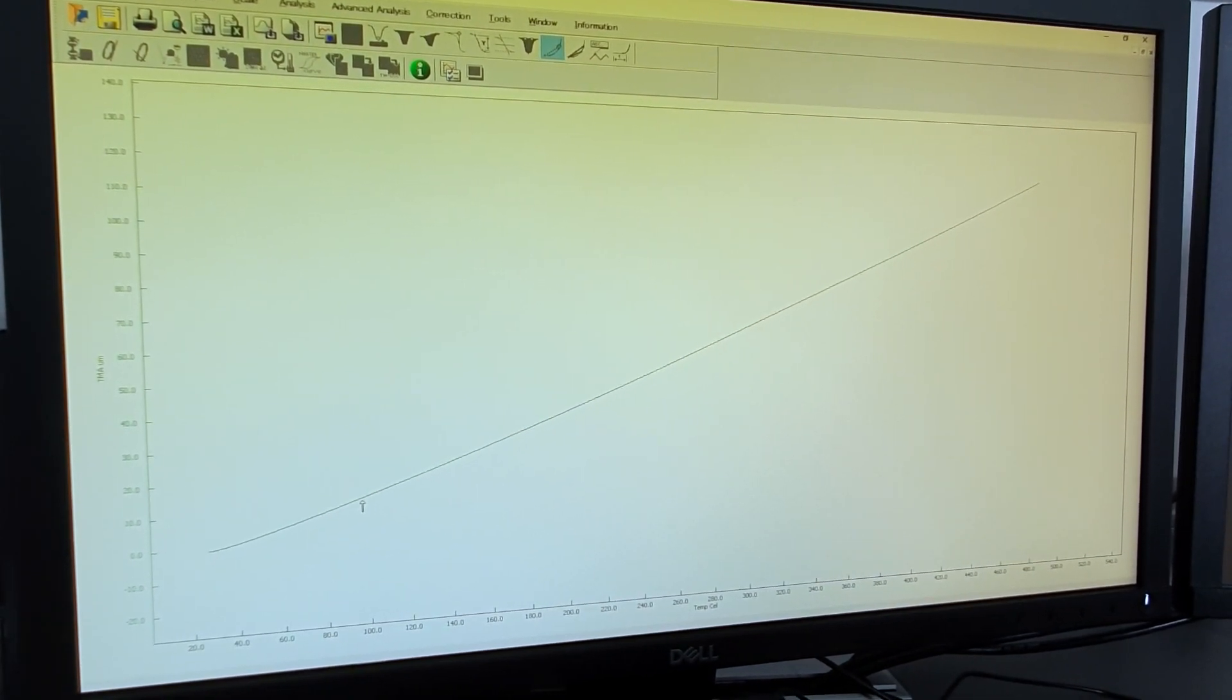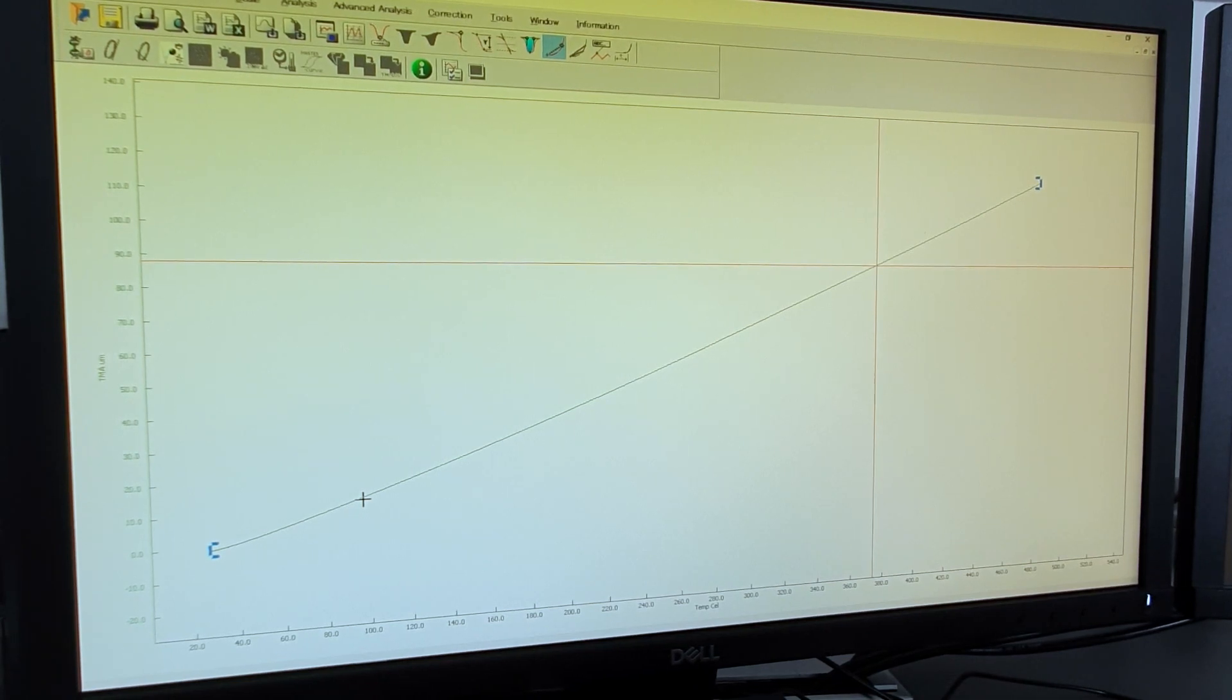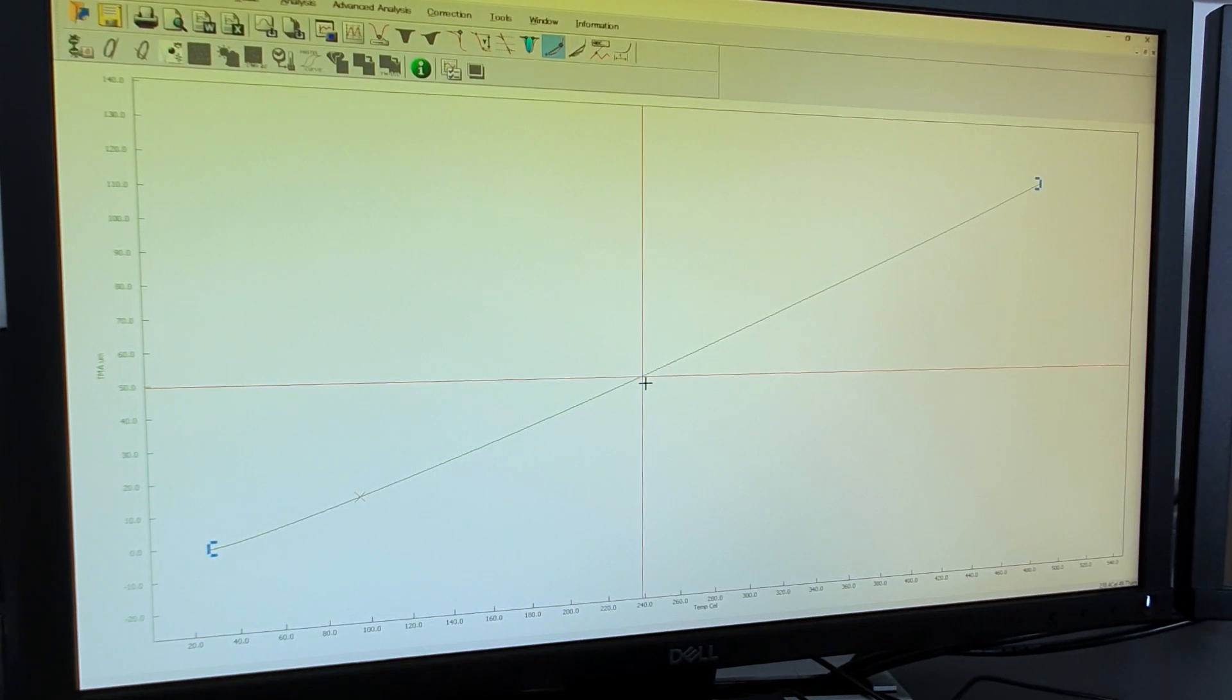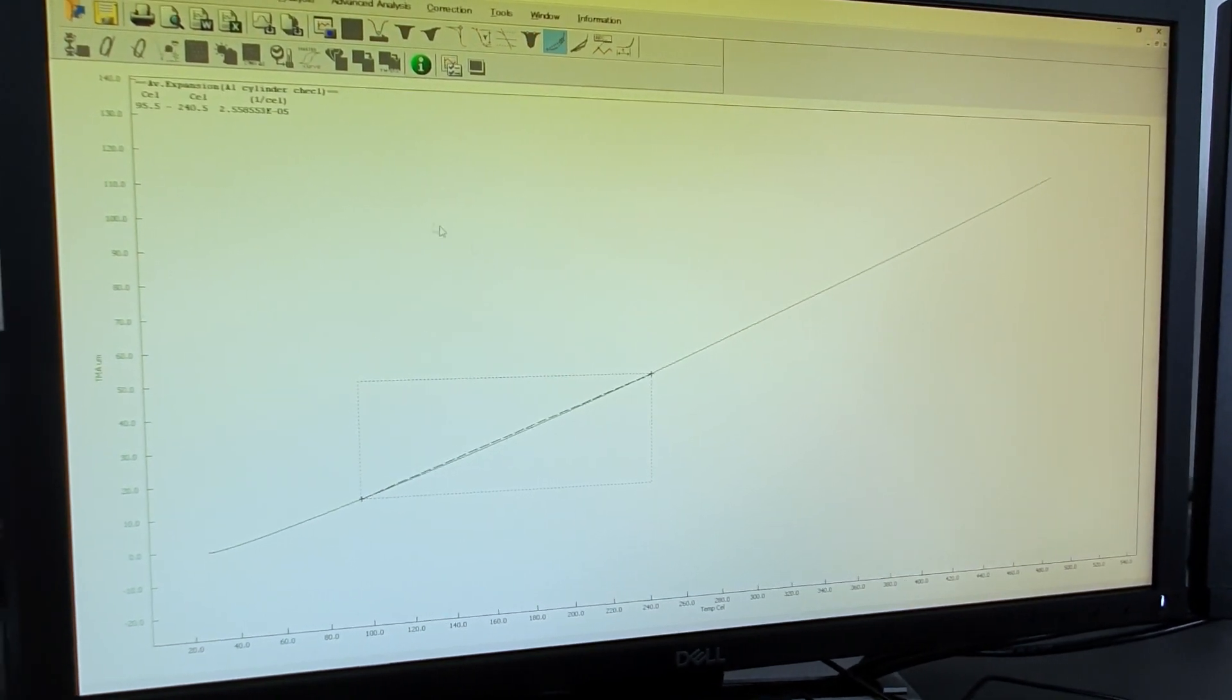To determine the coefficient of thermal expansion, you can use our software to calculate exactly which values you get. So you choose your temperature range and then you get the values.